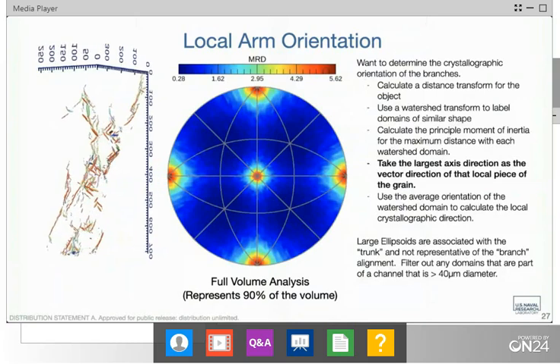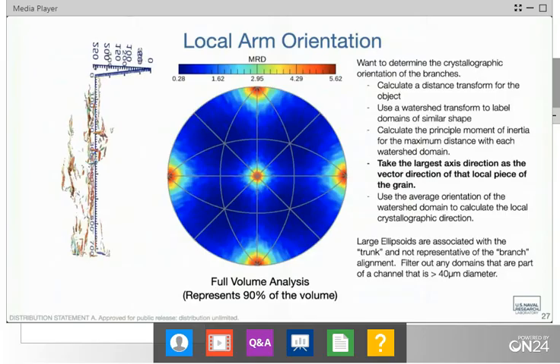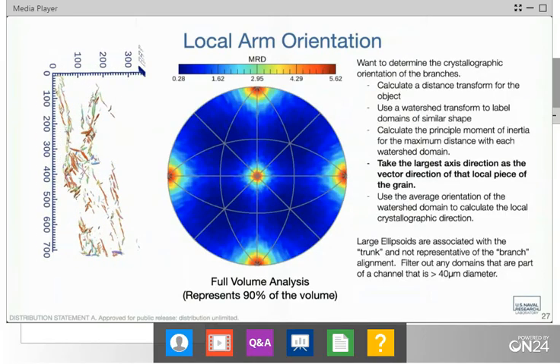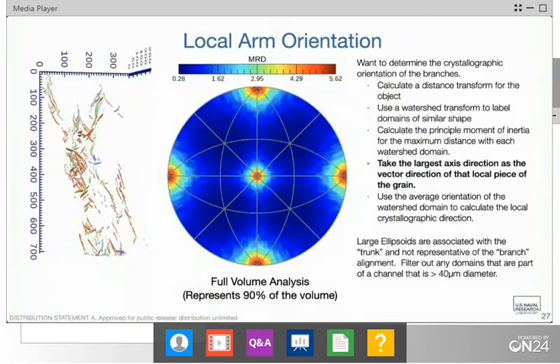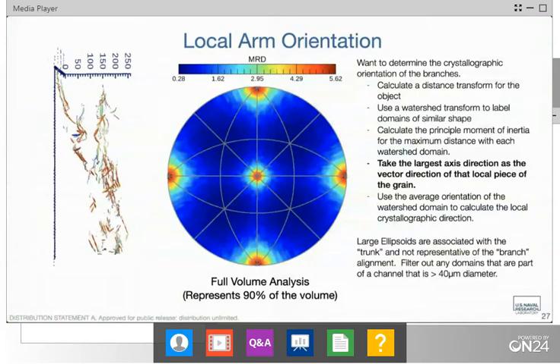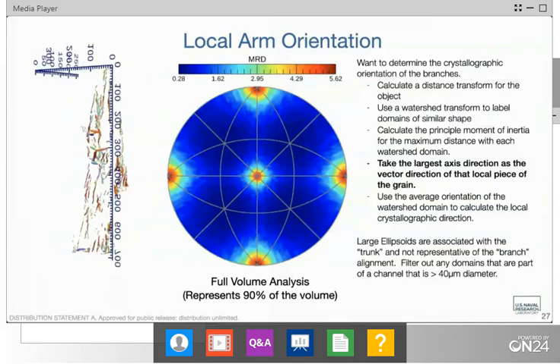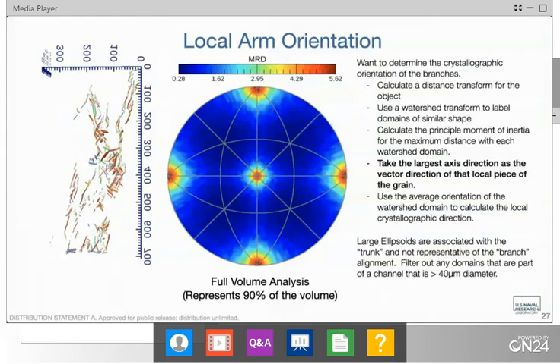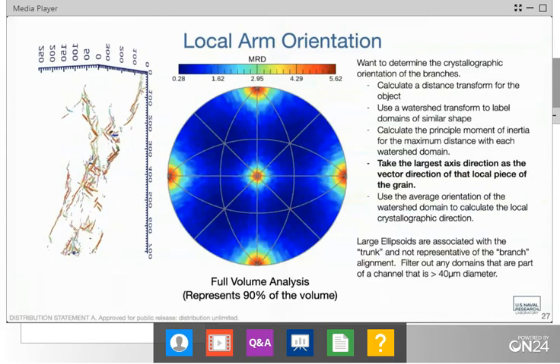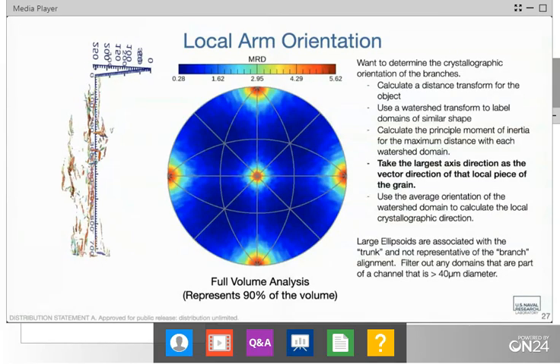So in fact, when we would run over the weekend, we would actually let our indents go away. They would be removed from our sections, and we'd have to come back and basically place them back in. So we got by without having hard fiducials on every one of our sections, but they were handy to have there for both depth removal, just to make sure that we were on track with that, as well as some of the global alignments. It was handy to have that as a marker.